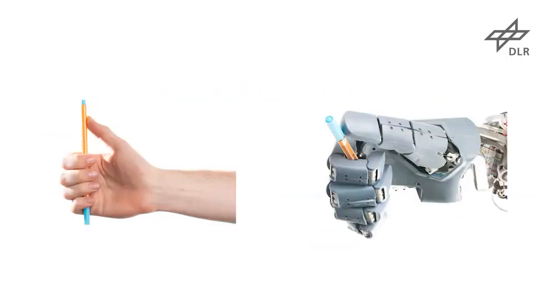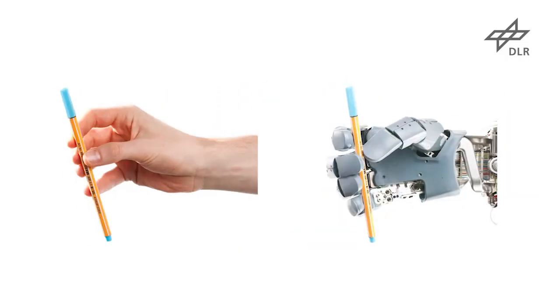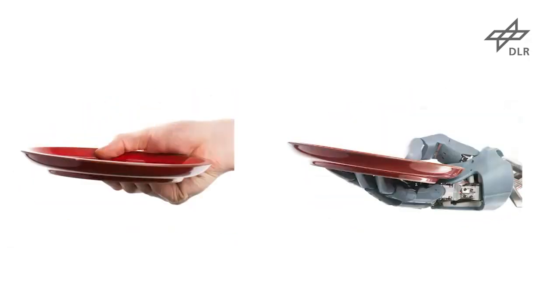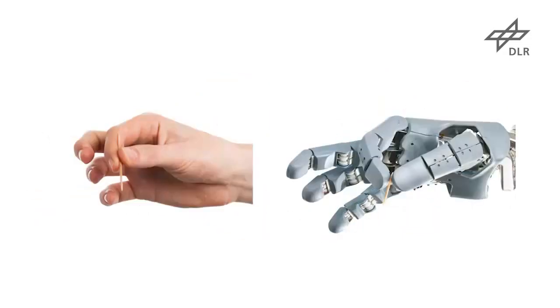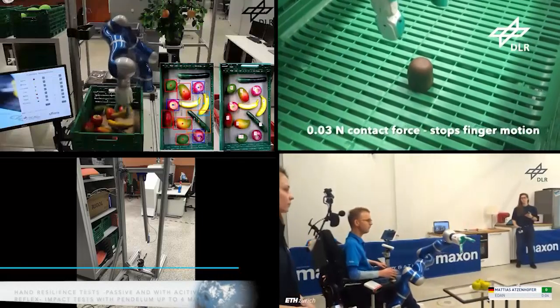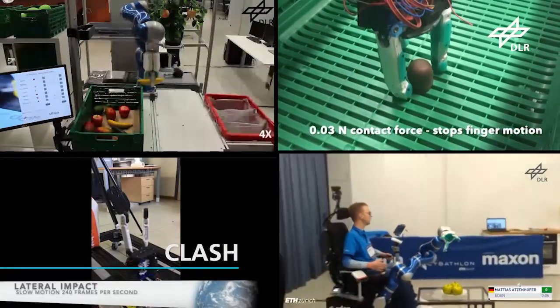The AWIWI hand uses tendon-driven antagonistic actuation that can absorb unexpected impacts and provide high grasping forces. It has a human level of grasping performance, being able to replicate all the positions of the main grasping taxonomies, and can impart in-hand motions according to the intended task.